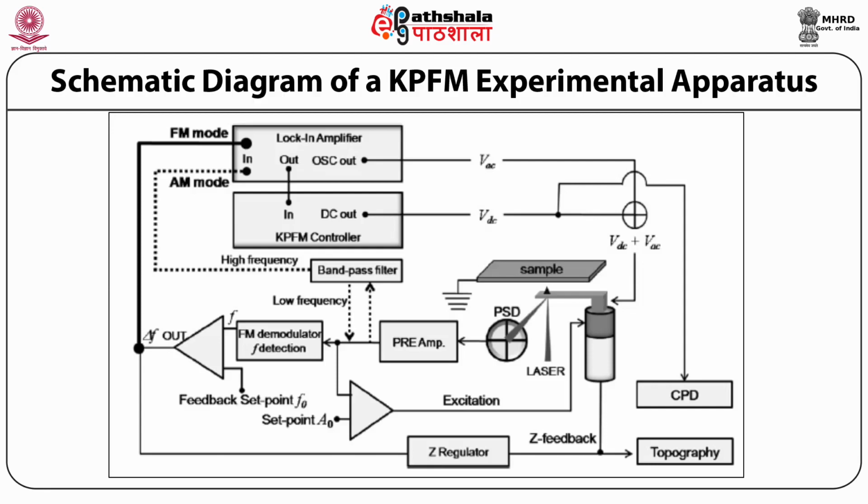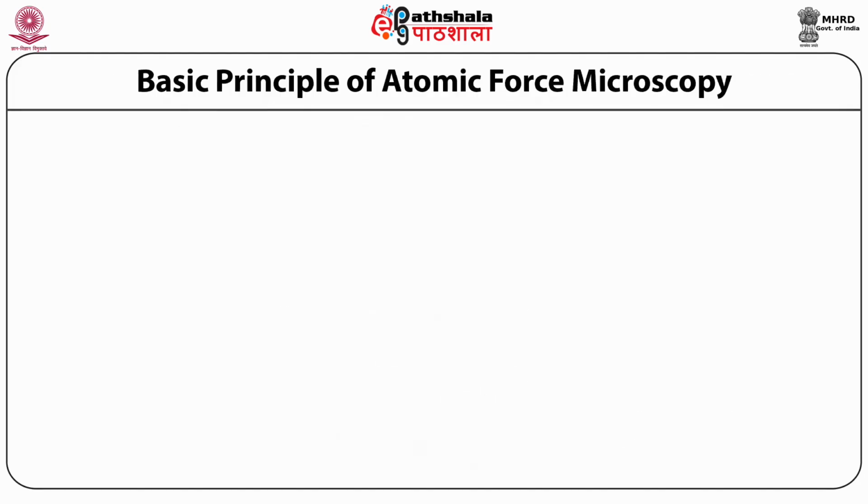A notable application of KPFM is the imaging of operational electrical devices to provide the high resolution potential profile. These measurements provide critical near atomic scale information on the processing induced defect and their effect to the performance of the electrical device. Basic principle of atomic force microscopy.